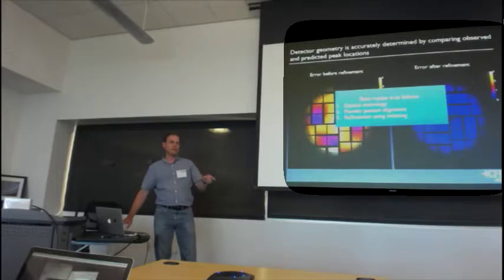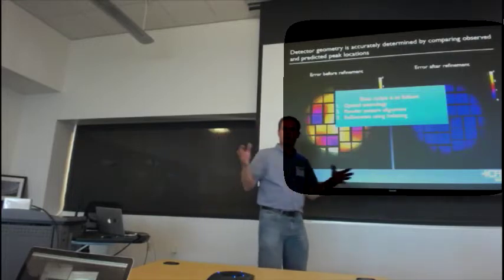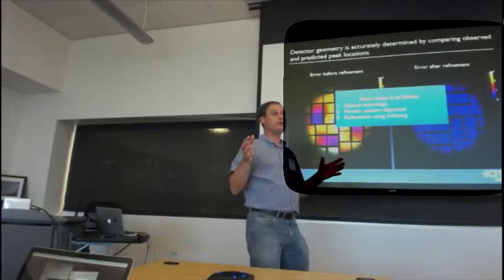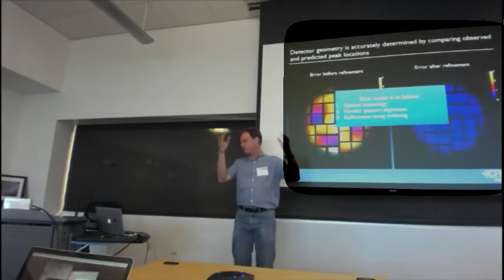John? The powder you're talking about there is a known structure, not your unknown. Is it a reference set? It's nice to do it with lysozyme or something with not too big a unit cell, but you can actually do it from the data itself in the end. You can actually re-refine on the data itself as you go along, but only once you're within a certain capture radius.